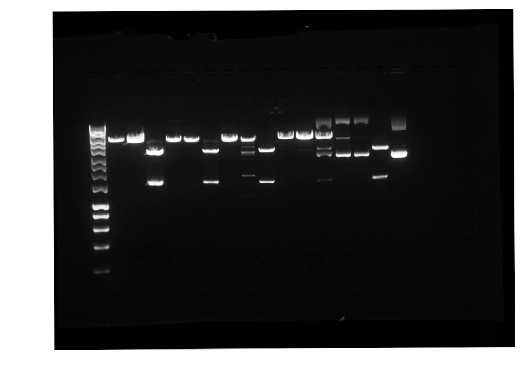Okay, so we can see our molecular weight standards just here and they're not quite as nice as they look in the picture that we previously looked at, but we can see that this is 1,000 base pairs just here, and up here we've got 10,000 and 8,000 base pairs very close together.